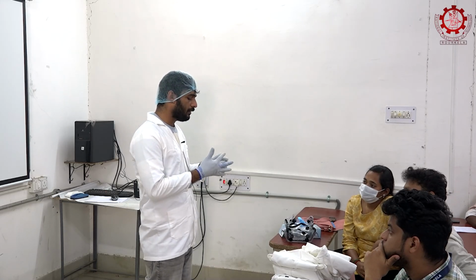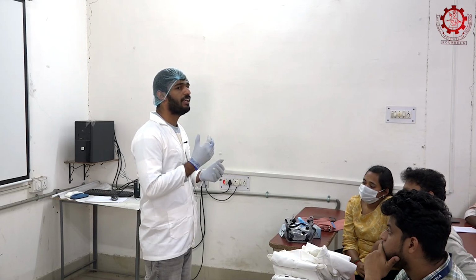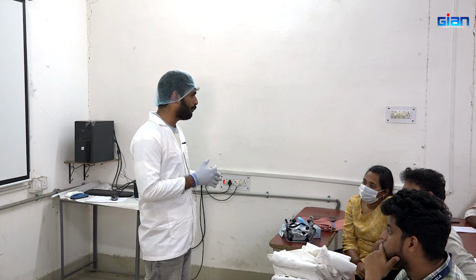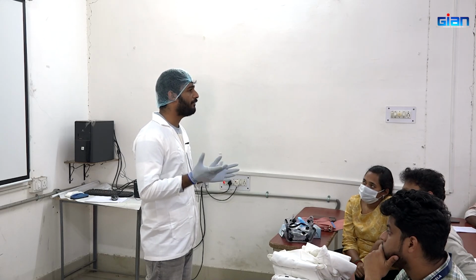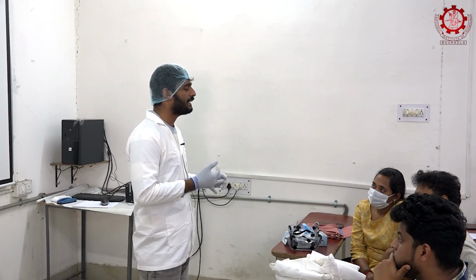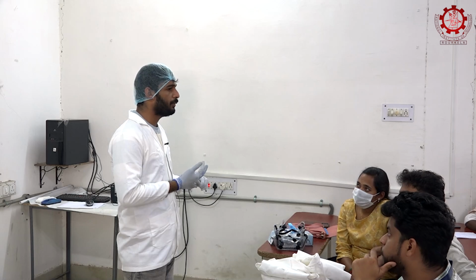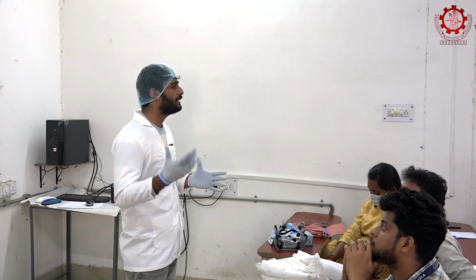So for those we will explain once again what we are going to do. First of all, we collected 3 different samples, but due to lack of time we will only have 2 samples: first one is crab and second one is shrimp. We collected the shells of these animals and underwent a drying process, and after drying the moisture content was reduced as much as possible.